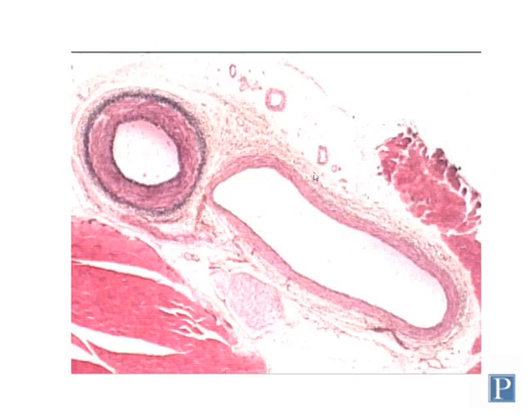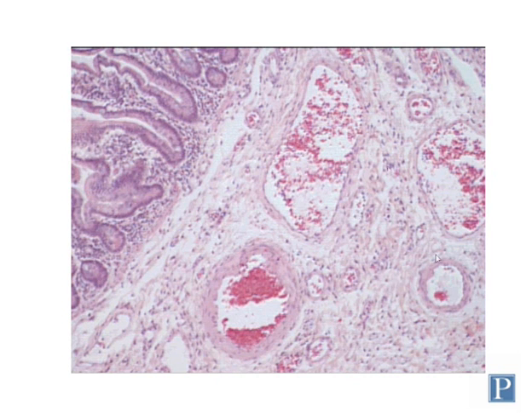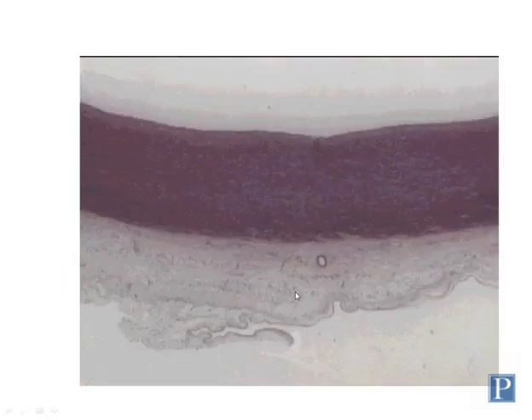One way you can do that is, if you can see nuclei in the layers, you can count the nuclei to get a rough estimate of the number of layers.